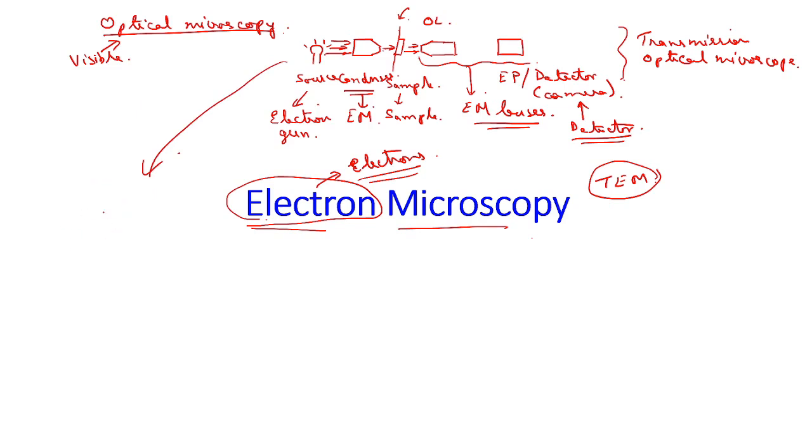We have seen that we will be having a source, okay? Then there will be a condenser, okay? Then there will be a sample, okay?